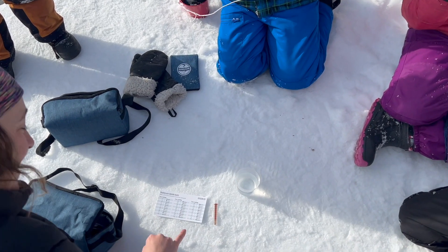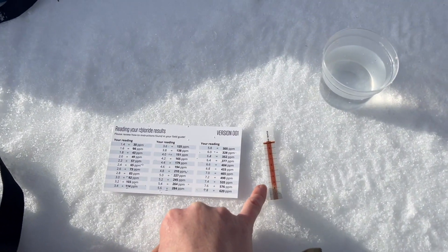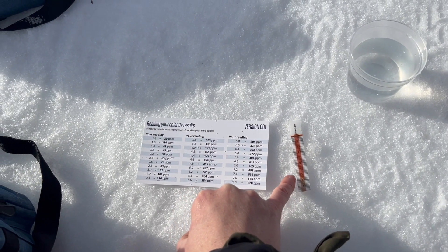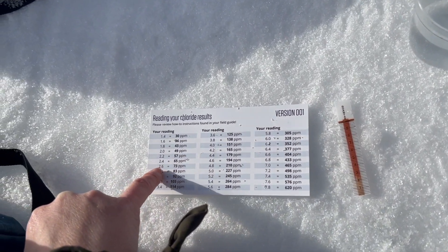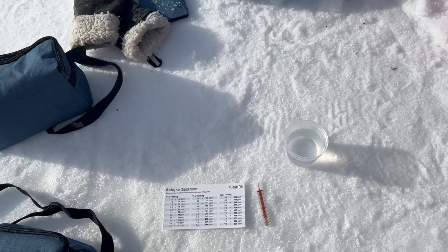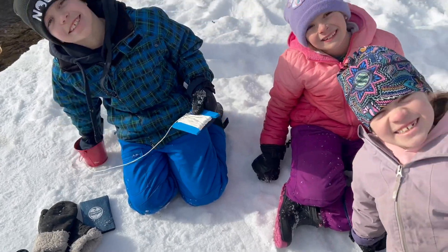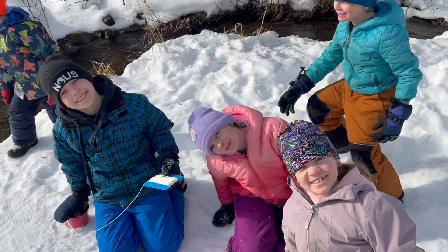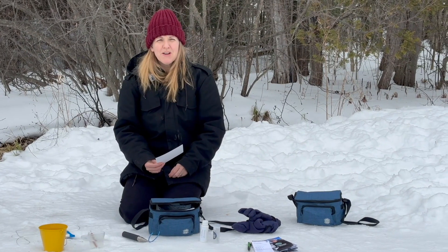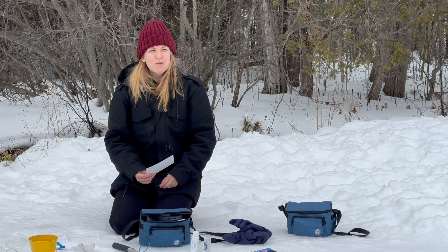As you can see here, our reading is 2.5. Using the chart, your reading translates to a value in parts per million — you're going to round it to the closest area. Here we see it's 2.6, which equals 73 parts per million.